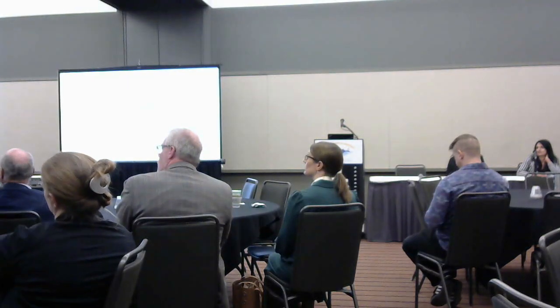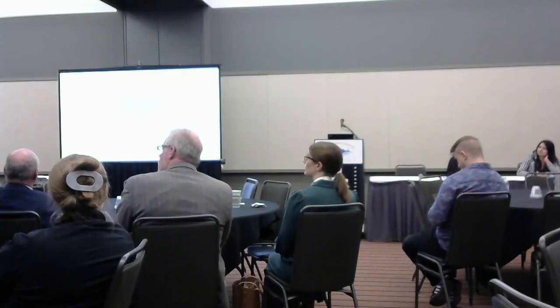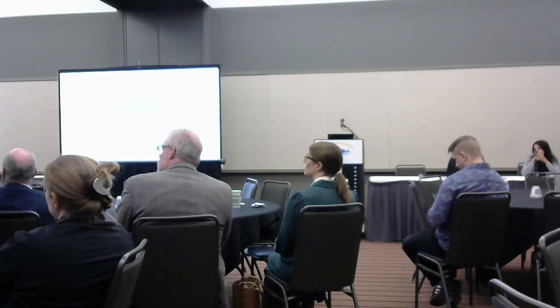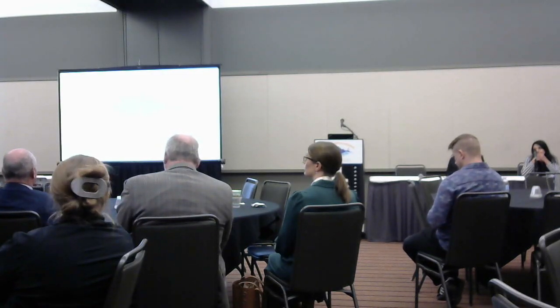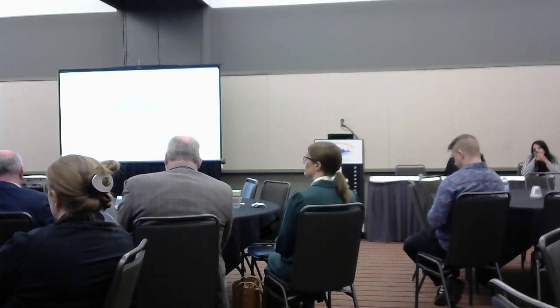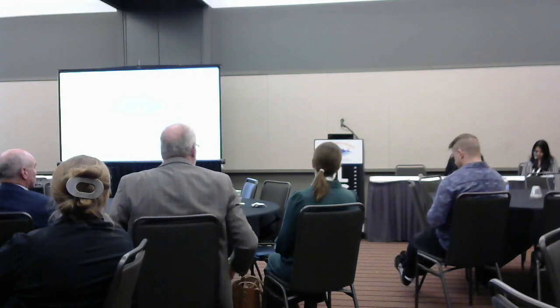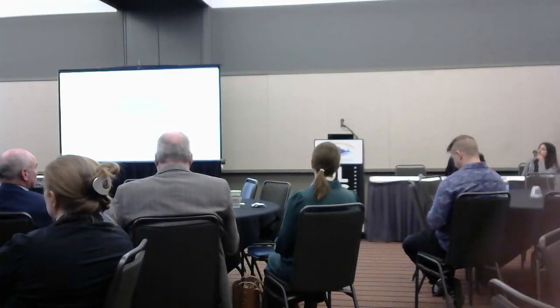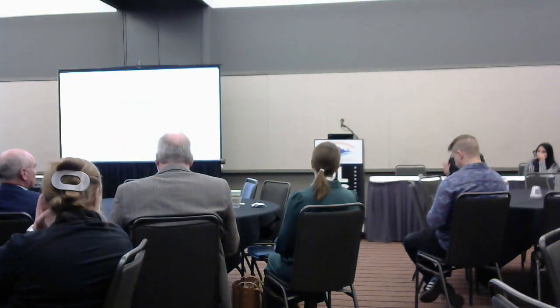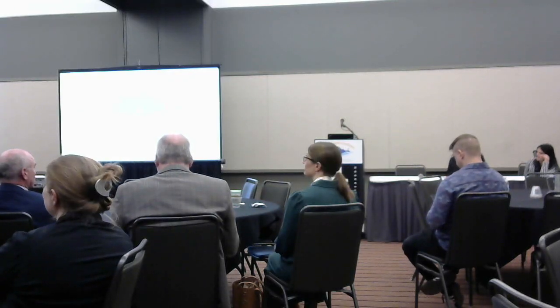I had a question about the image analysis classes or workshops that you put in. I'm working on building some of my own, and I have a specific question and a general question. The specific question is, for your demonstrations, did you just demonstrate it, or did you have them follow along? Yeah, it was a live demonstration, and they had access to the data, so the expectation was that they would follow along, which, as you're planning, takes about twice as long as you actually think. Absolutely, it does.